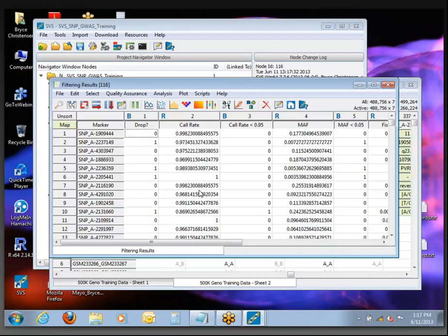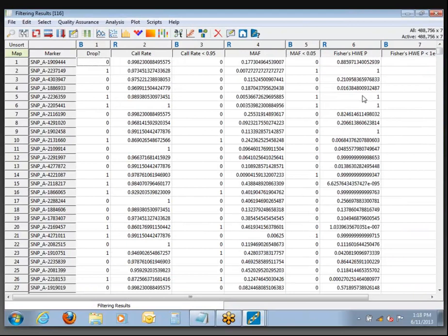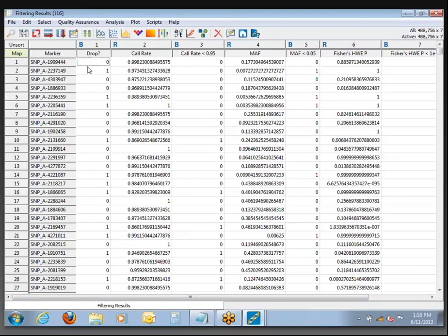You should see a report similar to this one that's just been created called Filtering Results. There are columns here for everything we asked it to calculate — call rate, allele frequency, and Hardy-Weinberg p-value — and there's also a column specifying which exact SNPs failed which exact parameters. Over at the far left is a flag specifying SNPs that failed for any reason. Since this is a binary column, that's why it has the letter B.